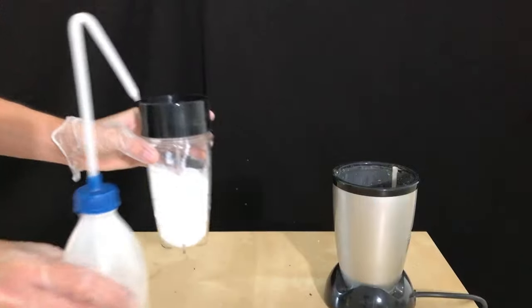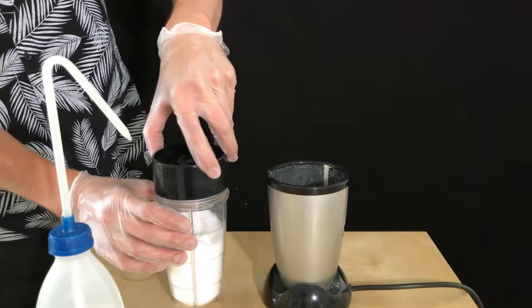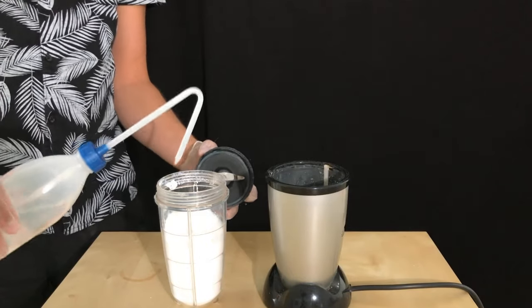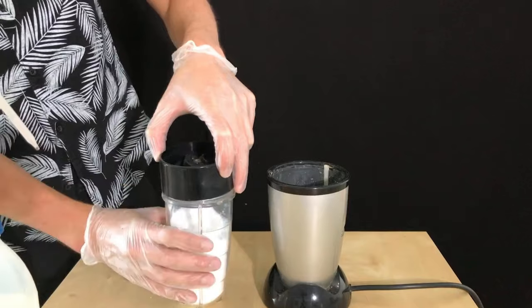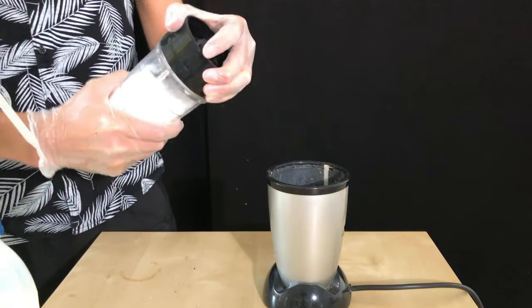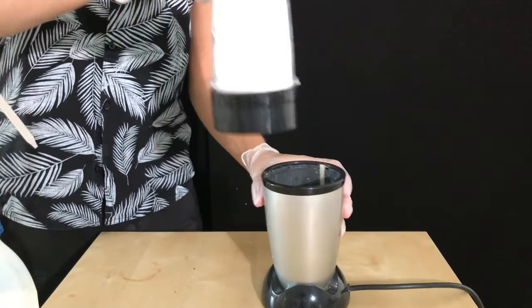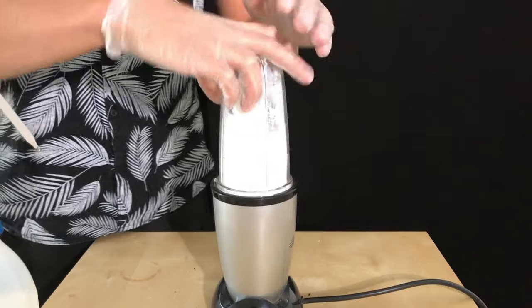The blender was cleaned, and it's time for a fresh attempt. This time, the distilled water is going to be added gradually. We started off by adding about 2 milliliters of distilled water. The blender was then closed shut, and as you're going to see in a few seconds, I had a problem with the blender closing. I might replace the safety switch with a normal switch someday.